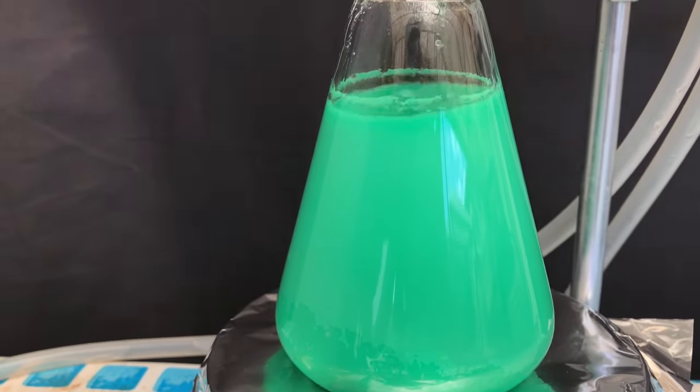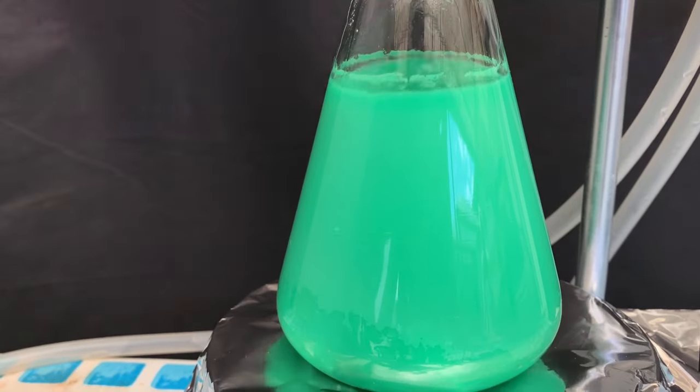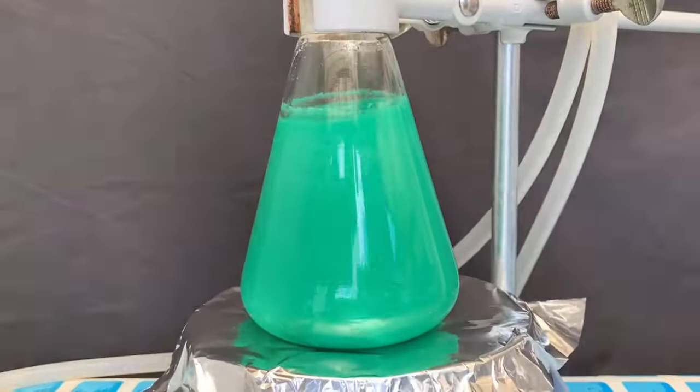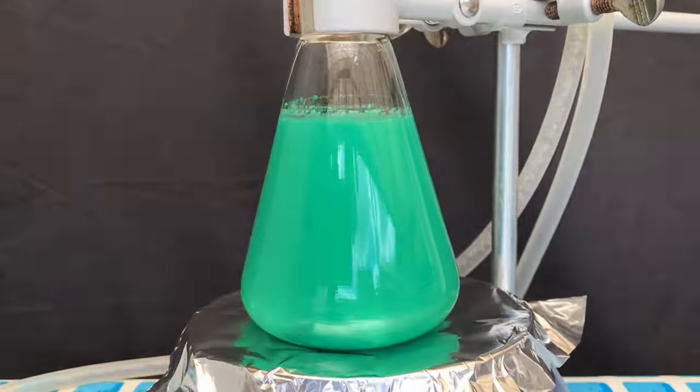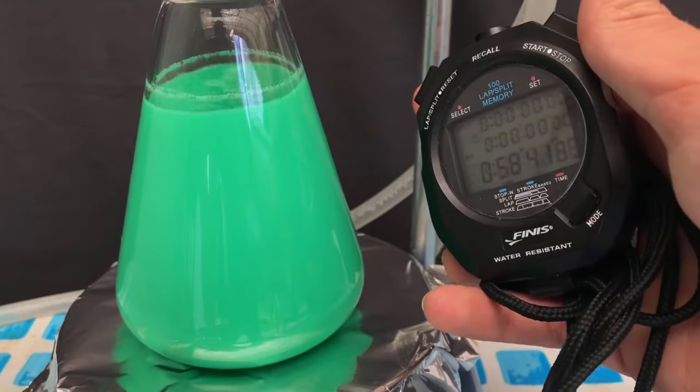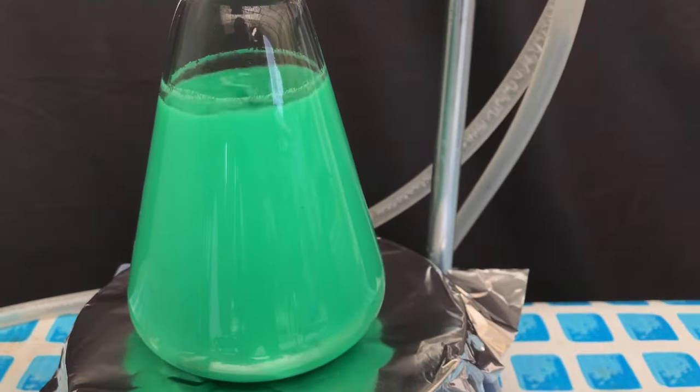As the mixture heated up, it rapidly changed its color from blue to green. Refluxing for an entire hour even allowed large flakes of arsenic 3 oxide to dissolve and react. Nearly 1 hour has passed now, it's time to stop.